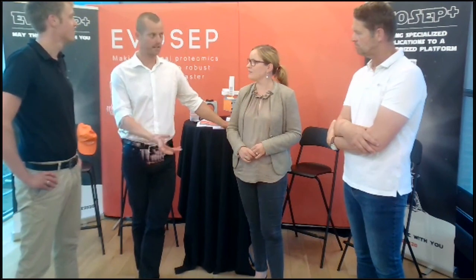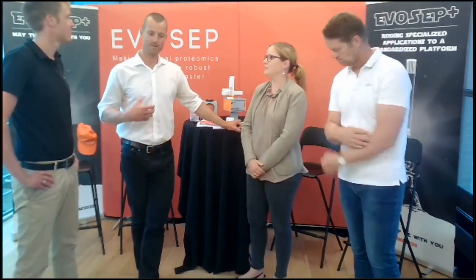I think it's so important to be part of these. We love being part of pushing technology forward, and it's the mass spec vendors, small companies like us and other small companies, and it's the proteomics community. It is really having these collaborations, trying out what we can do, pushing the boundaries. It's fun, and that can only be done if we work together. So I think it's very important to stress that exact point.